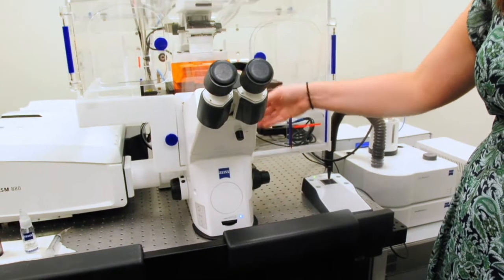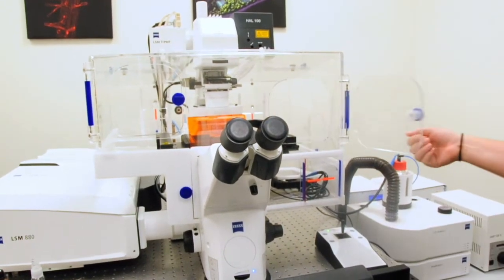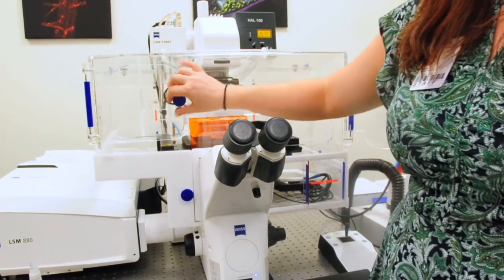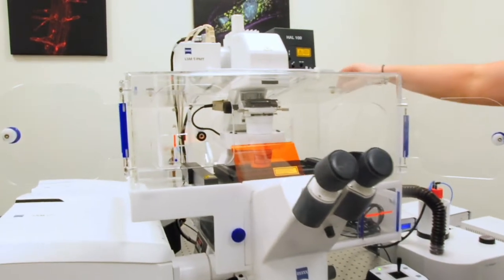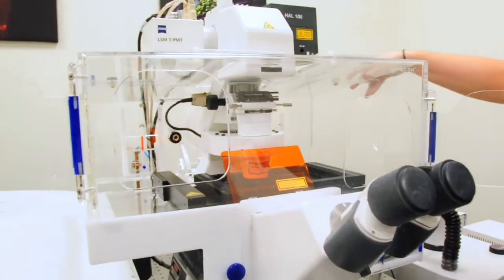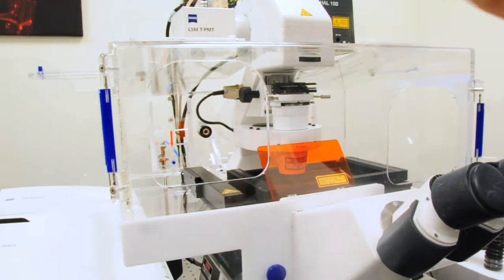And coming up, you can see that we have a box around the microscope. This is specifically to maintain an environment if we're doing live cell imaging. Otherwise, it's not necessary to have it. I'm opening up all the pieces so that we can actually get to the microscope.